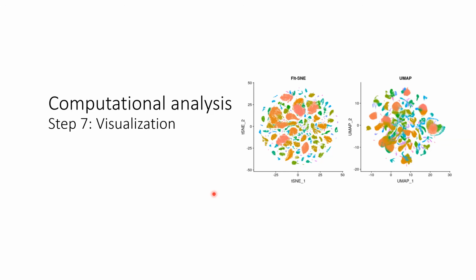And what we found was that around the elbow direction, it was more of a continuous function of distortion. So the additional dimensions after the elbow dimension do tend to have important information about the high dimensional topology of your data. So cutting it off using only the largest PCs can potentially introduce distortion into your analysis. There's a loss of information about the topology. Got it, thank you.